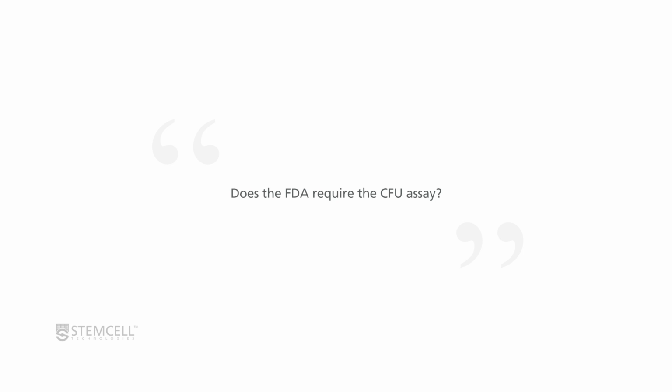Even for something like PV, it used to be done quite regularly. Now, of course, with PCR and the JAK mutation, there are other ways to identify PV. It can be used for PV diagnosis, but it isn't necessarily required anymore. But the FDA suggests it a lot, and if you're going to have a good potency assay, they really want you to know that you've done the CFU and that it actually correlates with the CFU because there's so much literature on that. But finding another potency assay has been difficult, and there's been a lot of people looking at that in the last 10, 15 years, and nothing has really stuck as of yet.